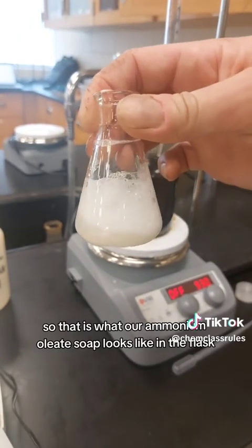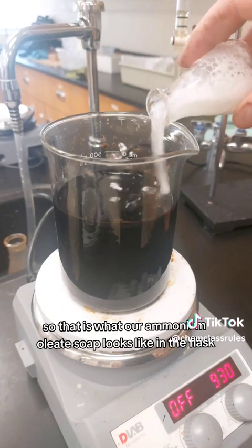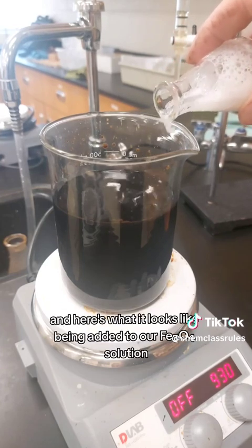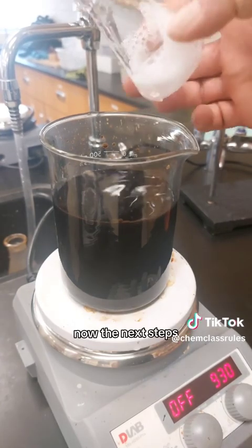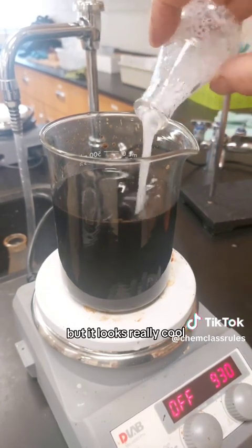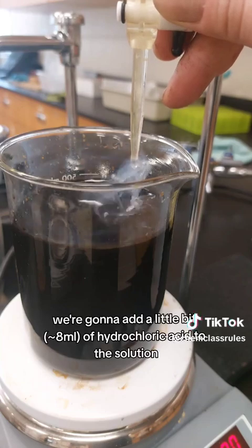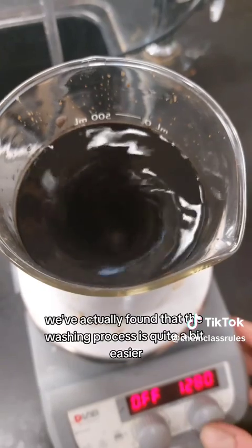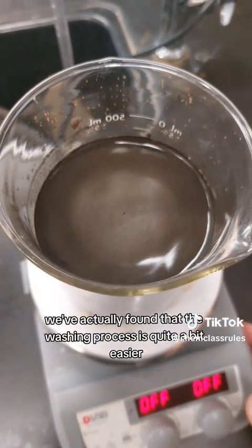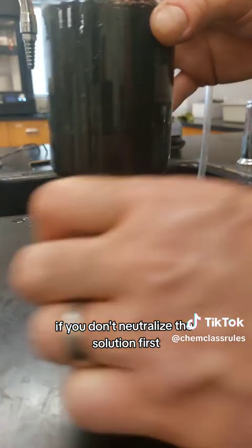That is what our ammonium oleate soap looks like in the flask, and here's what it looks like being added to our Fe3O4 solution. Now the next step is not actually necessary, but it looks really cool — we're going to add a little bit of hydrochloric acid to neutralize the solution. We've actually found that the washing process is quite a bit easier if you don't neutralize first.